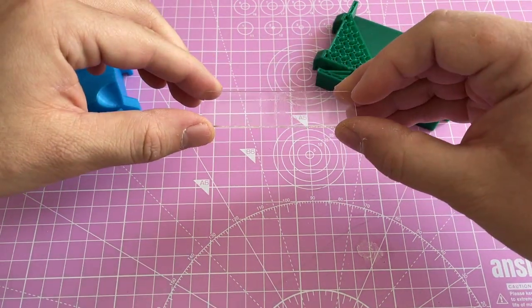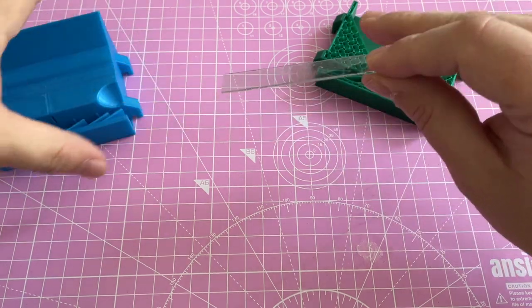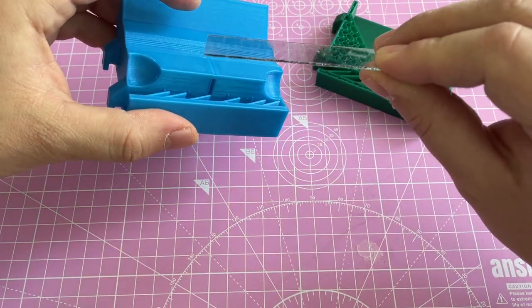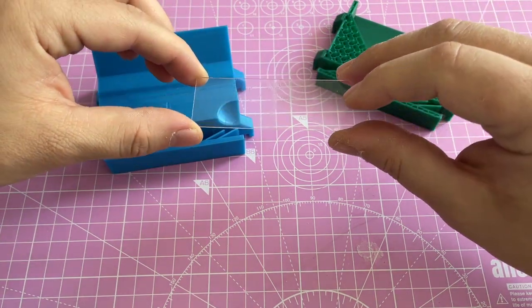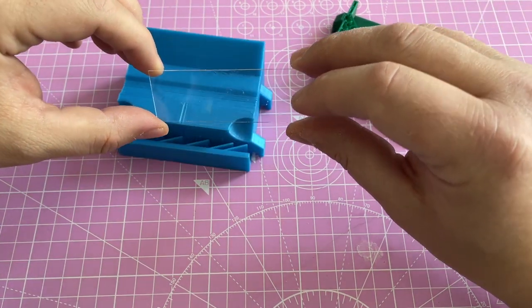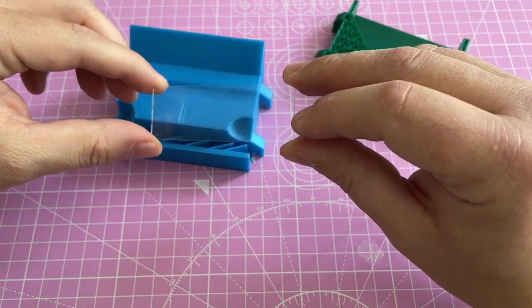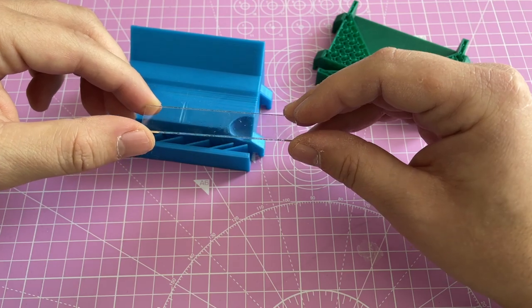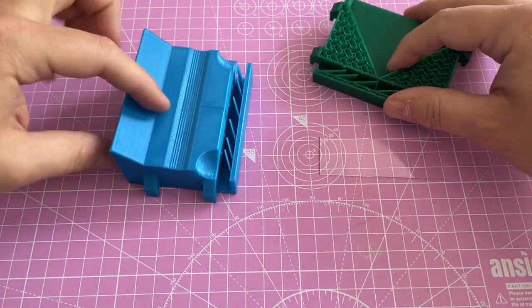For the slide, you need something sticky for the particles, on the part of the slide on which you want to collect the particles. I found that some silicone oil, very sticky and thick silicone oil, works best. And now that we know how it works, let's see how to put the grease on the slide, put it on the bike, and then we'll check on the microscope what happens.